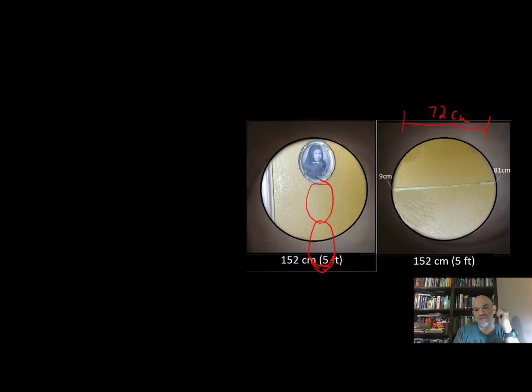And so when I do that, this is 0. This would be 1 object. That's the second of the same kind of object. And then my diameter ends right here. So we don't go a full 3. We go almost halfway into that one. So that makes here, I would say that now is it's not 2 and it's not 3, but maybe 2.4. So my fit number here would be about 2.4.